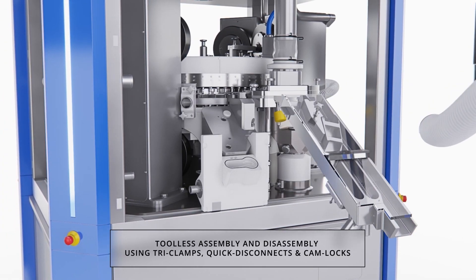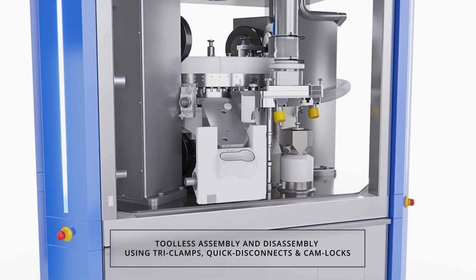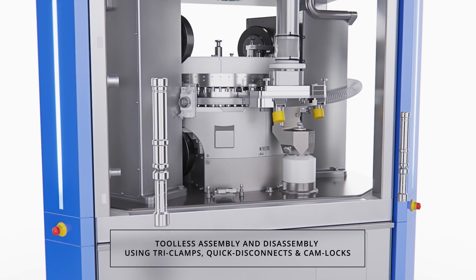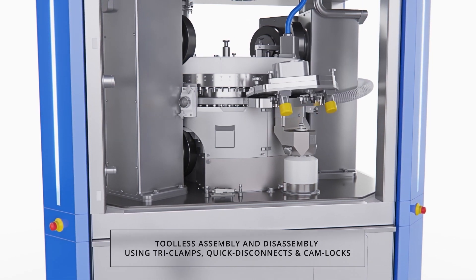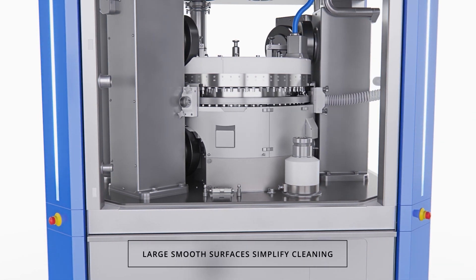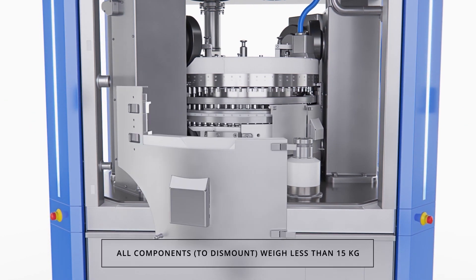Due to the streamlined design of the compression zone, only a limited number of quick disconnect components need to be removed to go from full production to turret removal. The disassembly process requires no hand tools and all components are removed effortlessly.